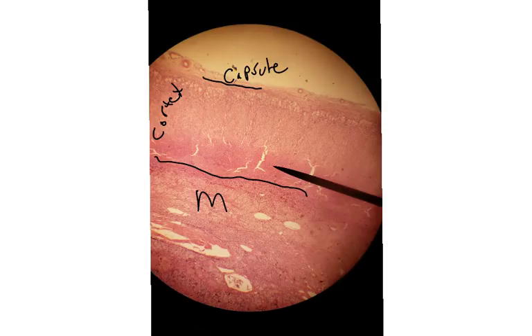Now, if we look at the cortex, we can see right here and right here there are some obvious divisions. Now, this area near the capsule is called the zona glomerulosa. And now, that should probably sound familiar because recently we've talked about the glomerulus in the kidneys. Well, glomerulus really is just a word that means ball or sphere. And if we look really, really close at this region, these bubbles are kind of sphere-like or ball-like. And that's how it derives its name. Next, we've got this area here, which is called the zona fasciculata. And below that, a really, really dark region called the zona reticularis.